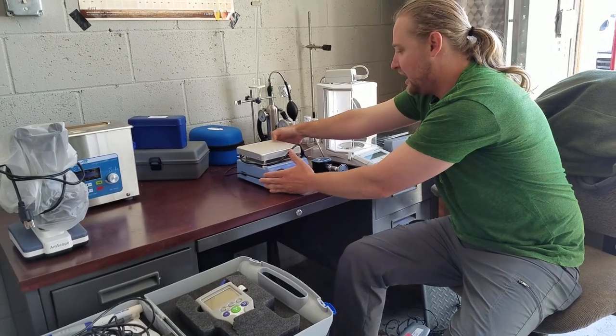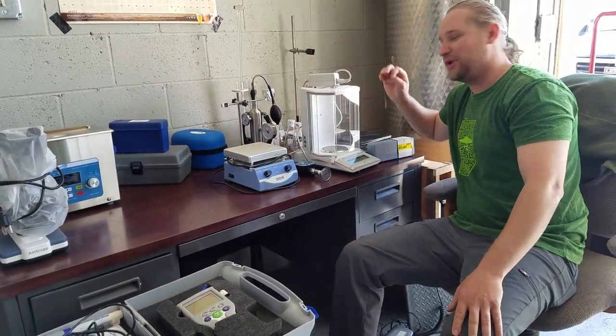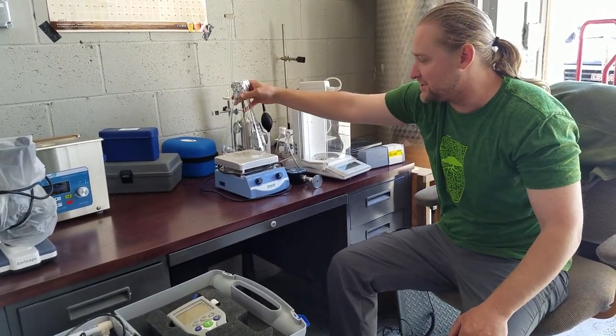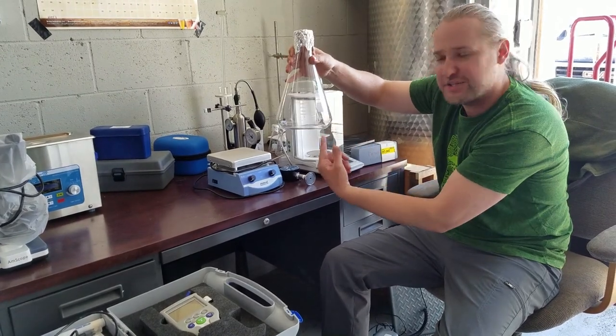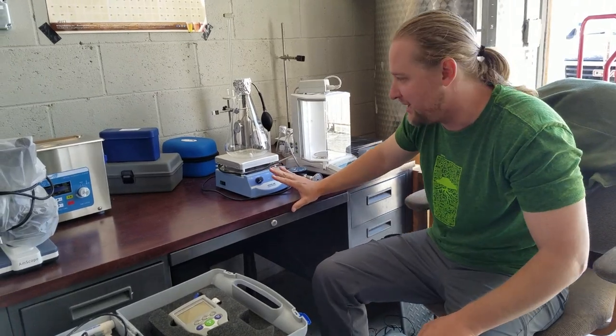We have a hot plate with a magnetic stir bar. We use this with our 2-liter flask — put some dry malt extract in, make our yeast starter. There's a 1-inch flea in there, which is the magnetic stir bar that spins around and mixes it up. A hot plate is really nice to have.